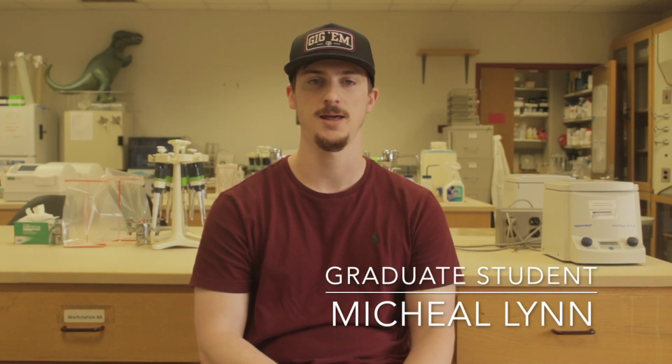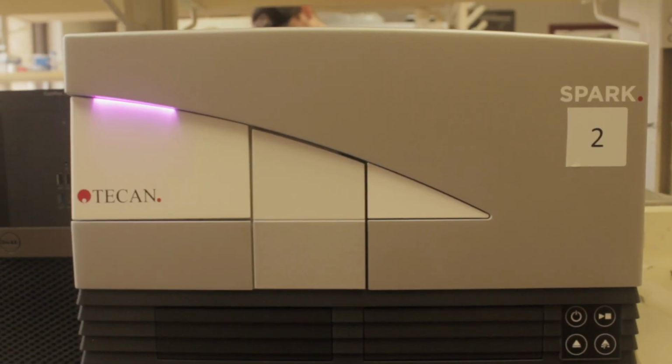I'm Michael, a PhD student conducting research in the Kurouski Lab. Investigating the impact of lipid vesicles and fatty acids on the rate of protein aggregation is a massive part of our scientific pursuits. To facilitate these investigations, we employ state-of-the-art plate readers.